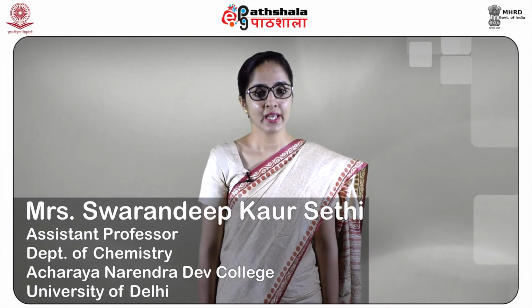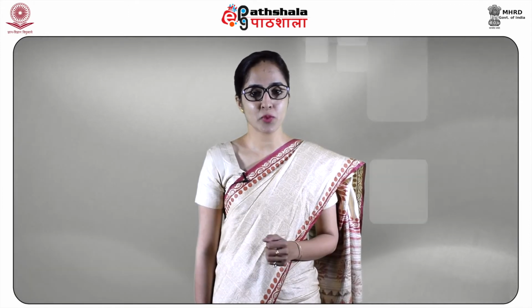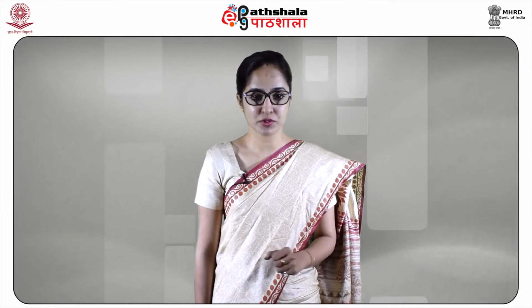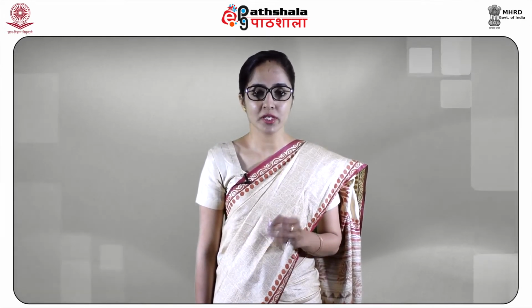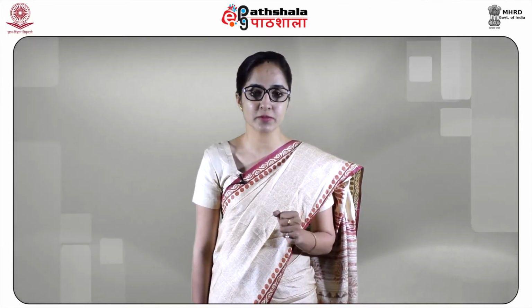Dear students, in this module, we will know about the qualitative and quantitative advantages of UV visible spectroscopy to identify the charge transfer spectra in various compounds, to evaluate dissociation constants of various acids and bases, and to analyze the thermal denaturation of DNA using UV visible spectroscopy.